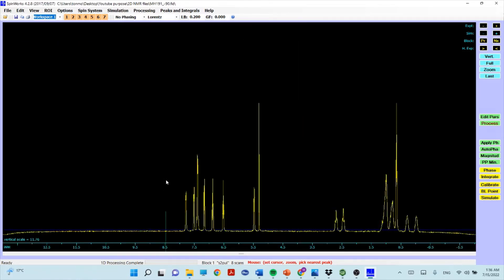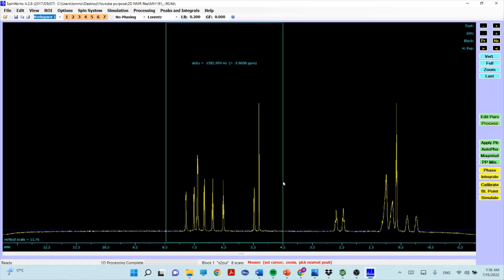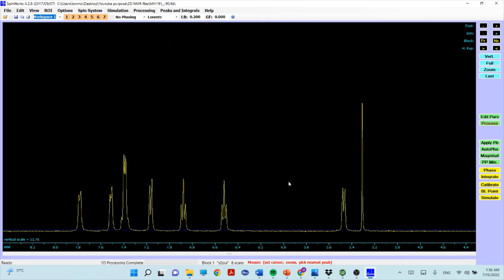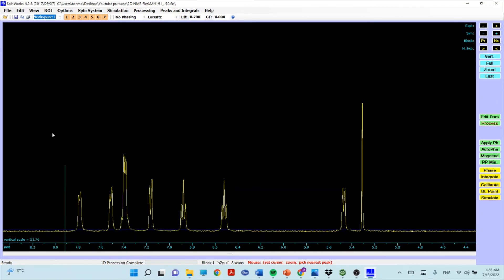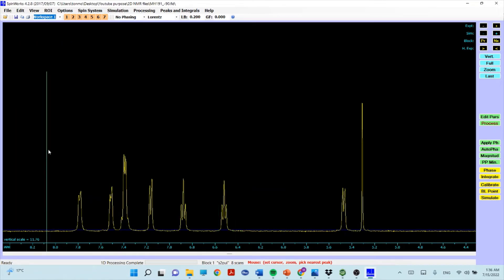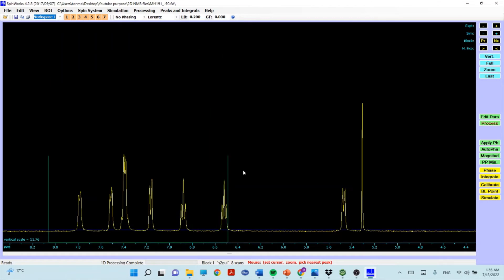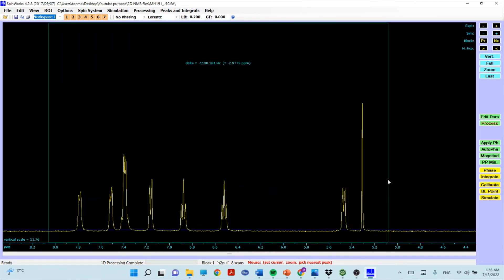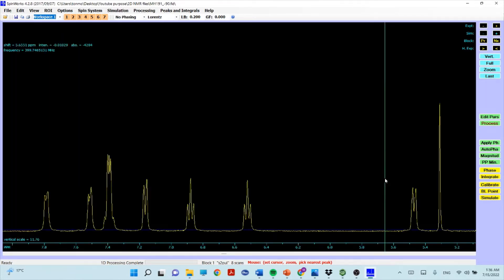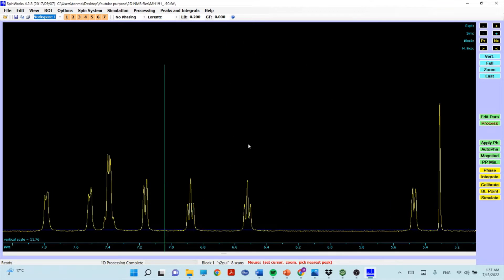Click Full to see the entire spectrum. To zoom in on a region, hold the left mouse button and drag to select an area, then release — it will zoom automatically. You can see the peaks clearly in the zoomed view. Just rotate the mouse scroll wheel to adjust the vertical scale without clicking.